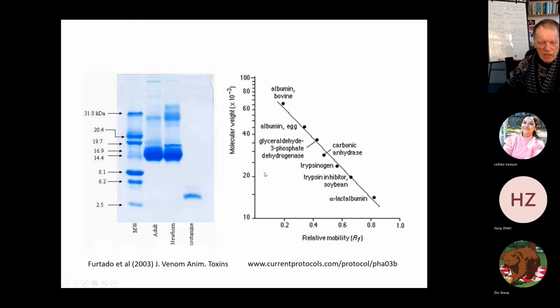And why this is relevant is, I think it's question 7 on the assessed questions that I've given you. You have a similar sort of plot to deal with. So you don't multiply these numbers by 10 to the minus 3. You have to multiply by 10 to the power 3 to get the actual numbers. Otherwise, you get nonsensical molecular weight values. You can't get molecular weights less than 1. So always make sure when you find something that your answer makes sense.